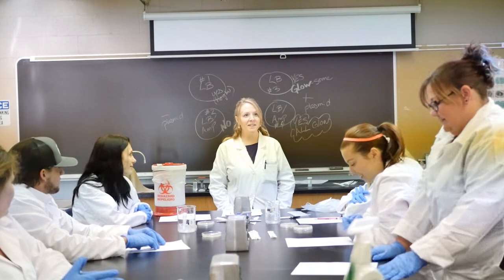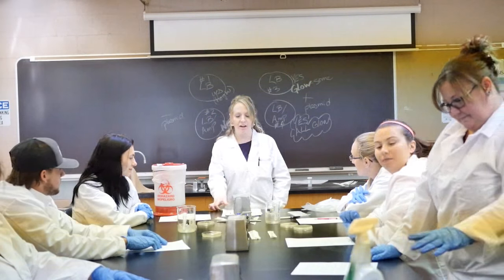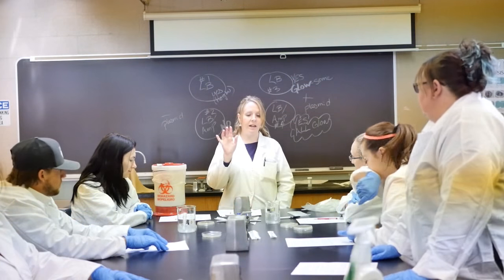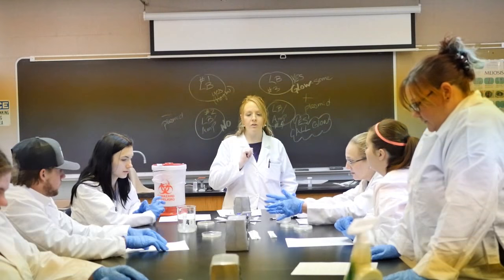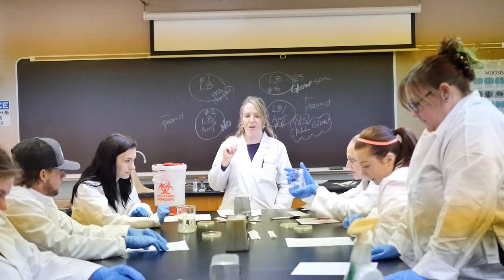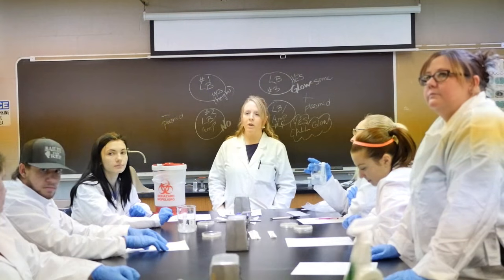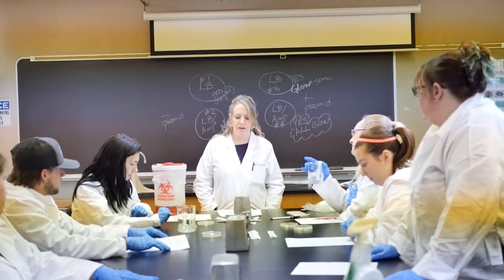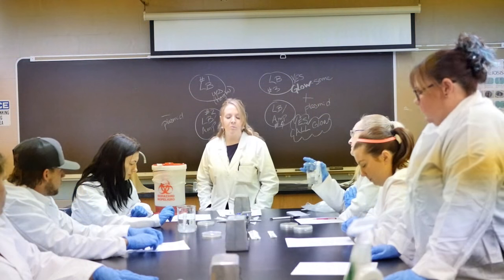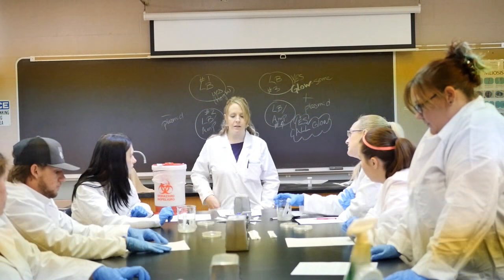So 15 minutes is up. So now that 15 minutes is up, it is time for the heat shock step. What we're going to do is we're going to take our beakers with our ice bath and our tubes in the ice bath where they have been incubating. We're going to take them over to the hot water bath in the corner of the room. It's at 42 degrees Celsius, and this is called the heat shock step. It will prompt the bacteria to take up the plasmid that is now in their environment.